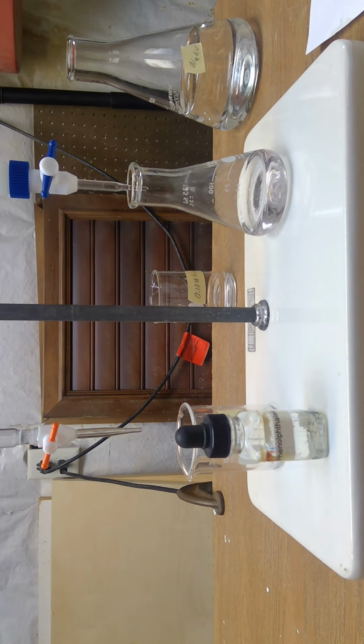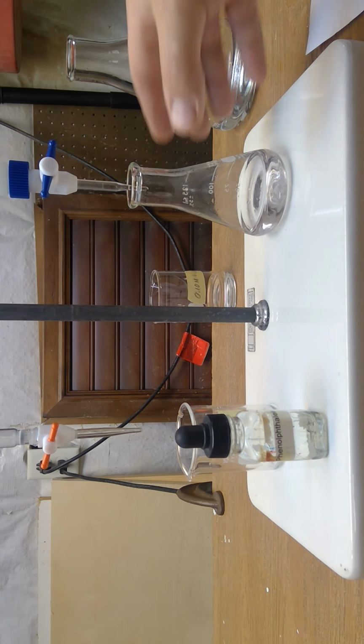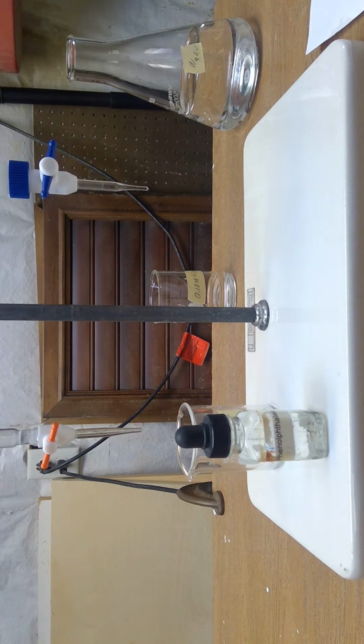So our final reading for our burette, number 2 trial, is 40.81, and the final volume was, for the vinegar, 34.00. So there's our second trial. Now, we need to do a third trial. So let's take this out.